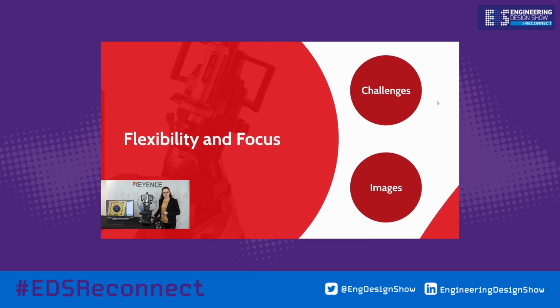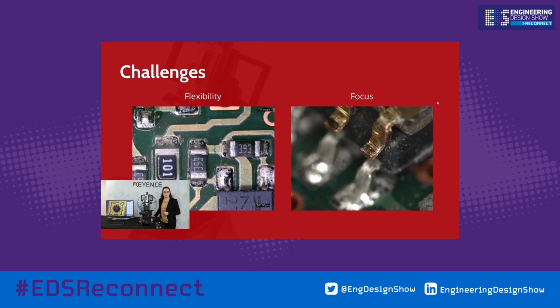Now, most traditional styles of microscope have a fixed frame and small objectives that would view the sample from above, directly top down onto the sample. This style of microscope is very traditional, but it does have several limitations. The first of these limitations is the range of angles that the surface or the subject can be viewed from. So, for example, on the left-hand side here, you can see this PCB, but you can only see the tops of the components and the flat surface of the PCB itself. With these microscopes, you typically have to manipulate your part by hand underneath the lens or fix it in place in order to view different sides of the components.